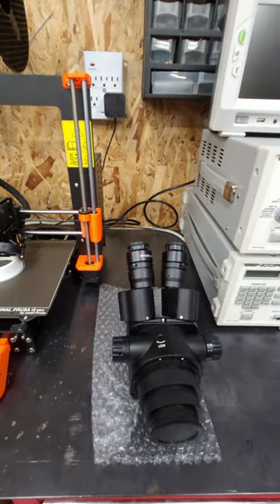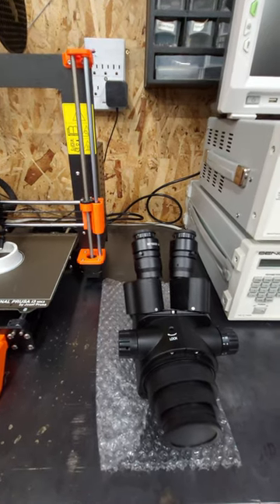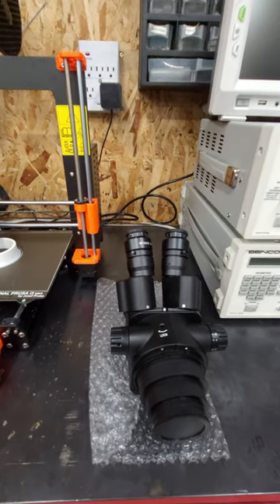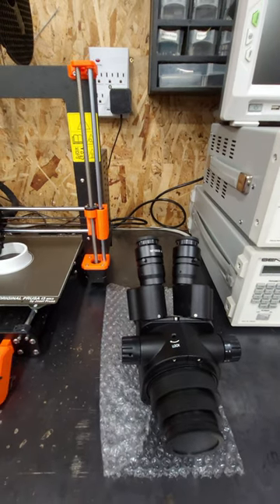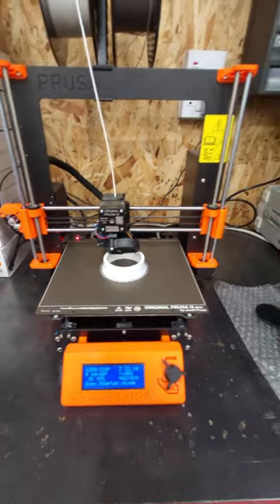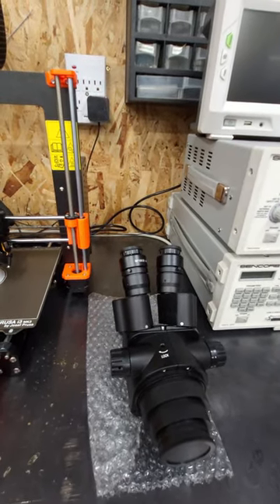I will go a little bit more in depth on the review of this and compare it to the Avon. We might keep this and use it for doing videos, or we might return it — I'm not sure. But right now it's looking like it's going to be a return bin item. Bye.